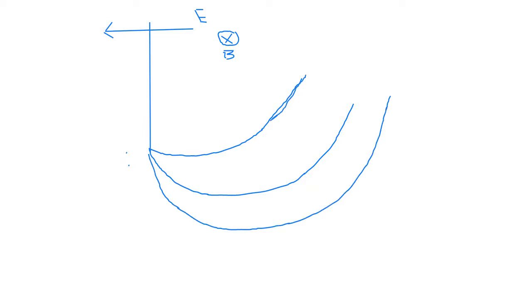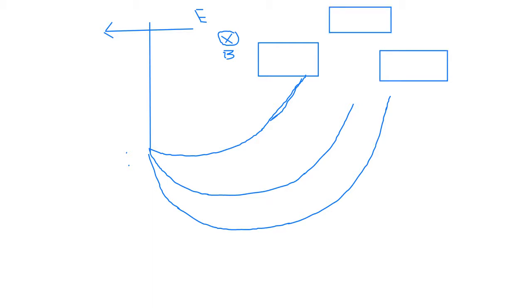So what we are trying to do with the help of this is to make blocks here. Let's say this is a block, and here you have the detector D. Block means that it will not allow your charged particle to go ahead. This will go, but this will not go. So these are your trajectories.